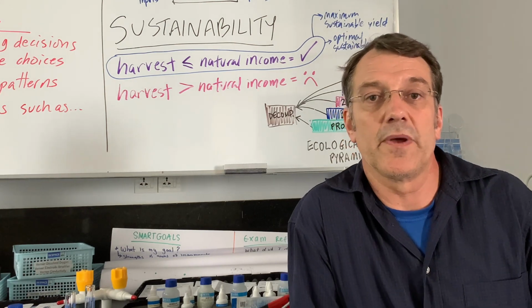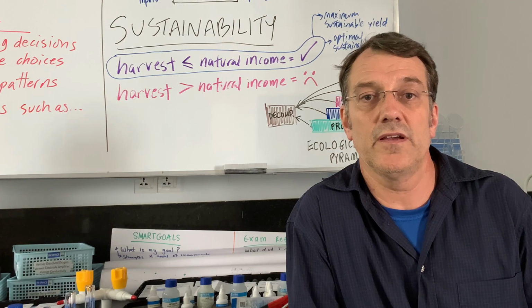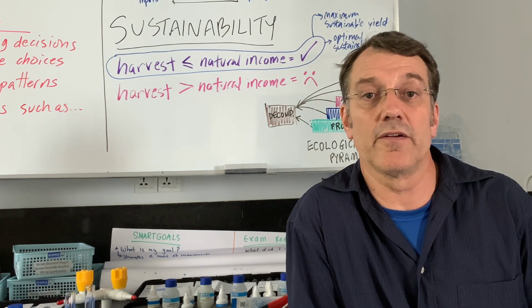Welcome to another Environmental Systems and Societies video. Today I'll take you through a practical activity where we test water for dissolved oxygen. I'll show you how we set it up in the lab, as well as where we went out and collected our samples. Let's get into it.